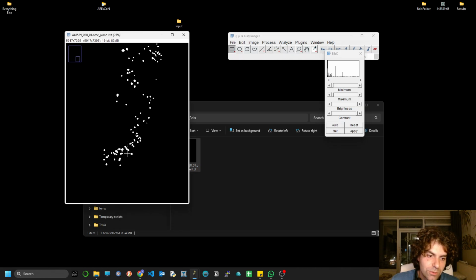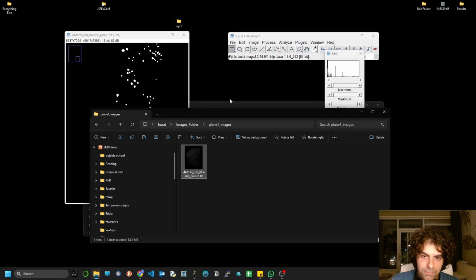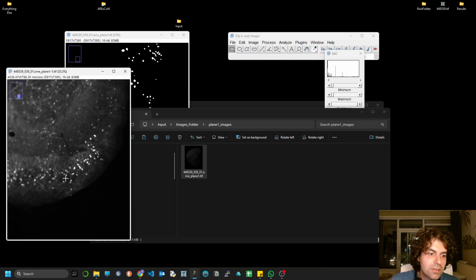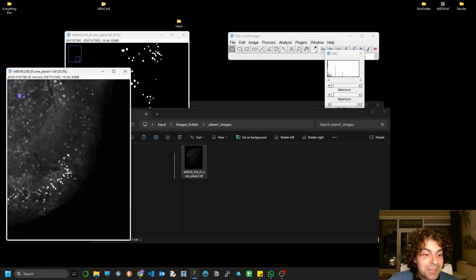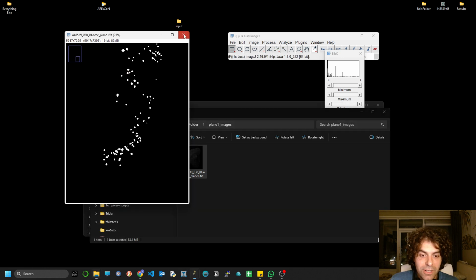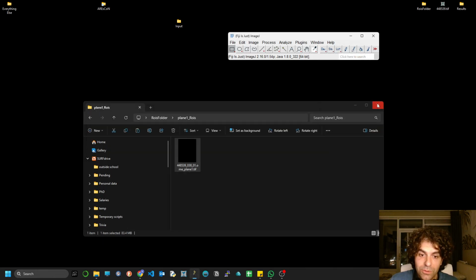And if you recall, it was these kinds of regions that were bright in our initial image. Let's have a look at our initial image as well. You see, it's mostly this region that has been detected, which makes sense because it's not that crisp, but certainly more clear compared to all the rest, and so on and so forth for the rest, of course, right? But we don't want the masks, we want ROIs. We continue with ROIs. So how do we do that?